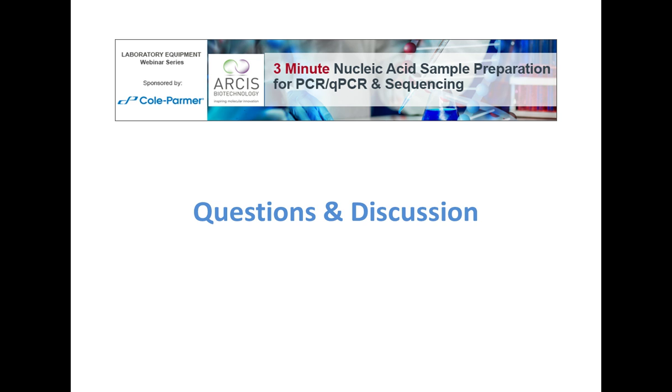Okay. And also, what volumes of reagents are provided in the kits? It's 50 reactions for the kit, and that's 50 reactions of 150 microliters of tube 1 and 50 reactions of 40 microliters of tube 2. Okay, thank you.